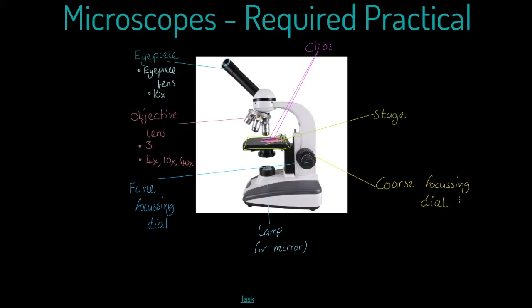We have our focusing areas. Over here, we have our course focusing dial. I'm probably going to refer to this as the course focusing knob for the rest of this tutorial. And here we've got the fine focusing dial. Finally, we have the lamp, which emits light, and that light is what illuminates our specimen.